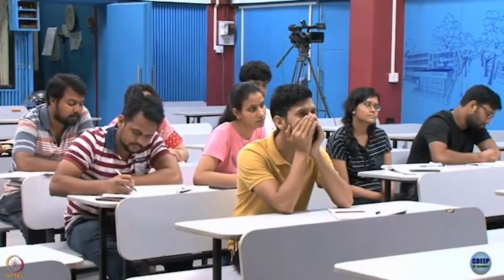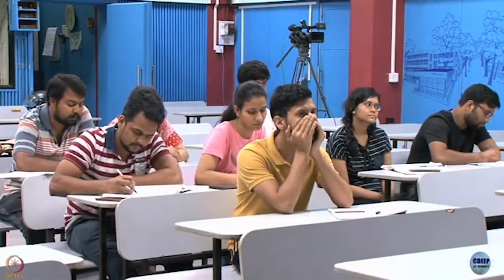Now, homework, is it possible, can you think of a situation where tau 1 and tau 2 are local parameters and A1 and A2 are global parameters? We can actually have that as well. Can you think of something like that? Okay, let me give you one example. Let us say I have a fluorophore that is bound to a protein again. So, today we are obsessed with nanoparticles and proteins.